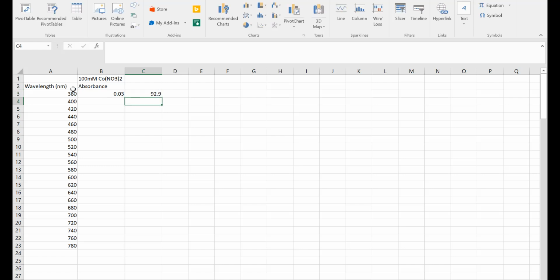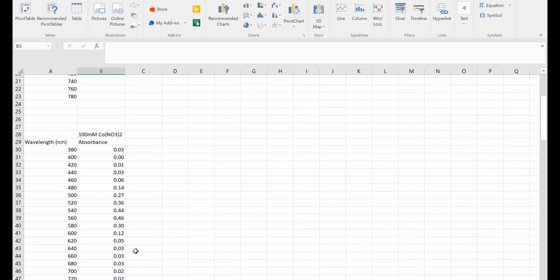And then what I would do is slide the wavelength over, change the color of light that I'm sending in. It would already be on percent transmittance. I'm going to record down that number. It says 99.54, and I'm going to record down the absorbance and basically go all the way down this procedure. Just to save us a little bit of time, that's essentially the procedure I did going all the way through. I've already done that for you for the absorbance readings.